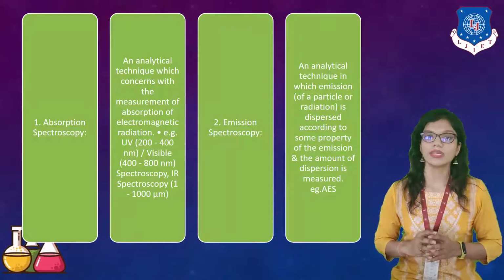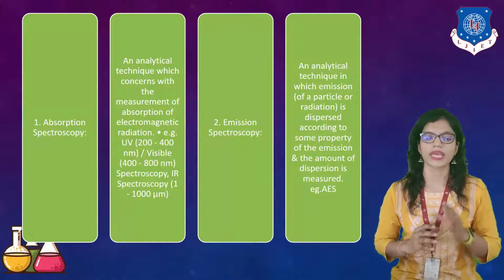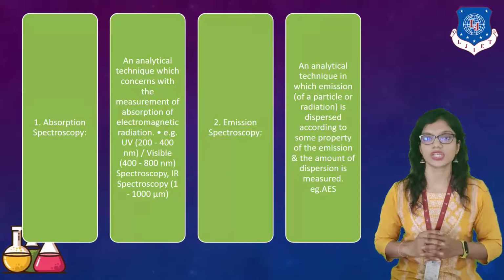An analytical technique which concerns with the measurement of absorption of electromagnetic radiation is known as absorption spectroscopy. As I said earlier, each and every element is individualistic in nature.